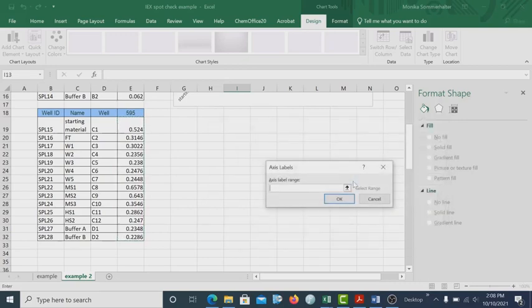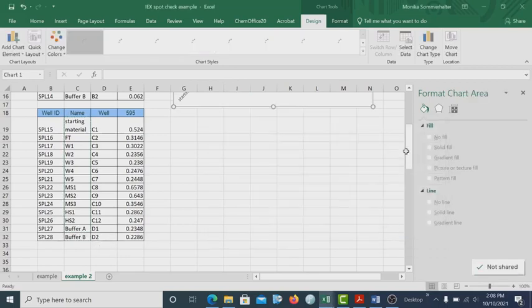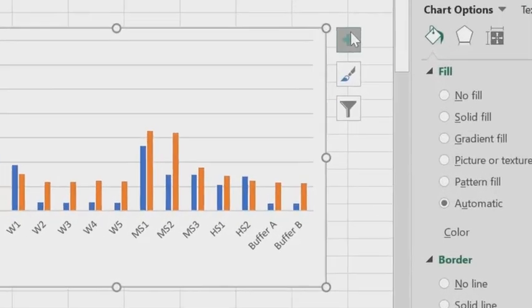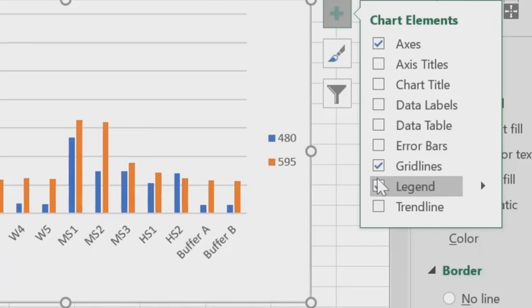The sample names are the same, so I can adjust them if I wanted to, but they would be taken by the other. So right now we have both signals displayed, one in blue and one in orange. Without the legend, we wouldn't know who was who. So here it would make sense to include a legend.